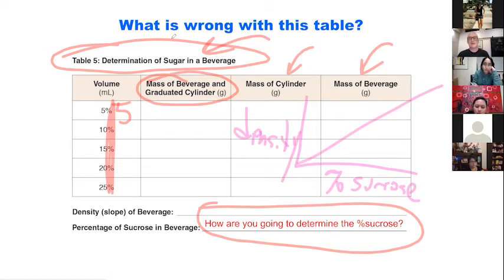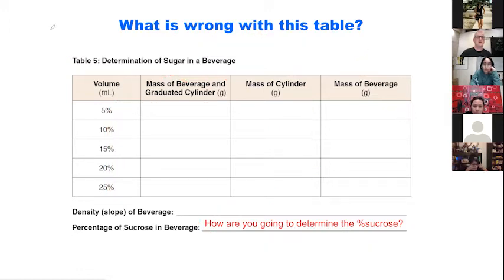And then figuring out what that relationship is. So excellent work. Okay, any questions before we get started on how we're going to do the experiment tonight? Give everyone a couple minutes to get their stuff together. Actually, the first thing we can do is the first part, which you don't need to have the goggles on or anything, and actually measure our cylinders. So why don't we just start with that?